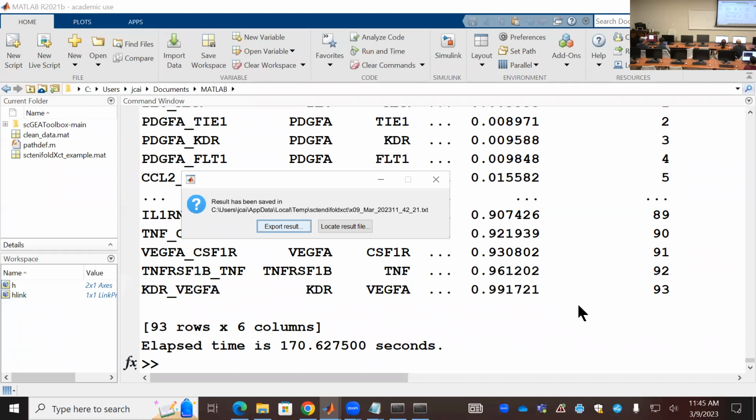I think you still have the problem of the Git. You didn't install the Git. So you have to install this correctly. Finish this, then install that. Then you go back to MATLAB. This takes time.